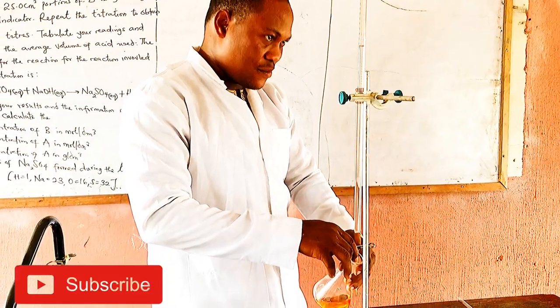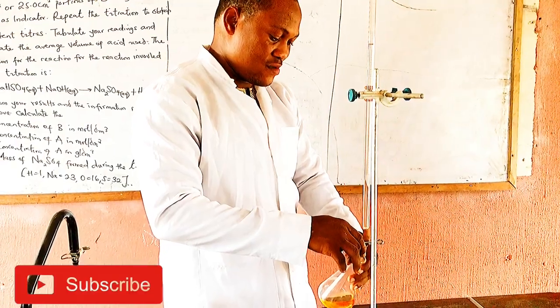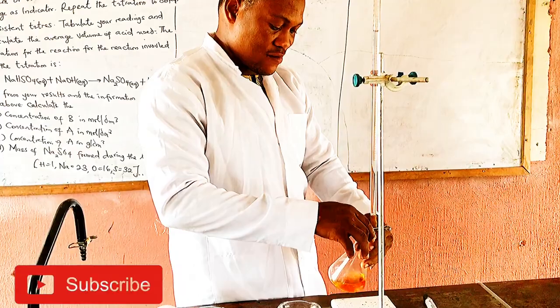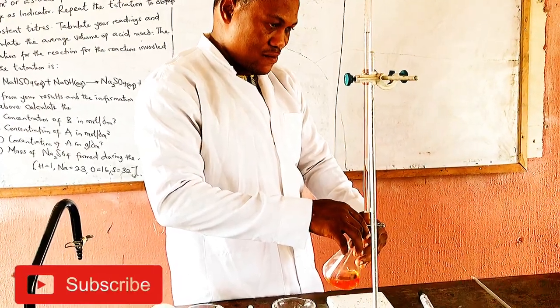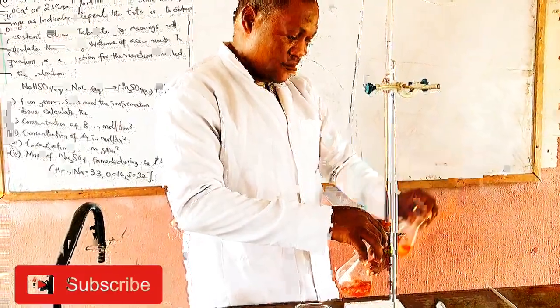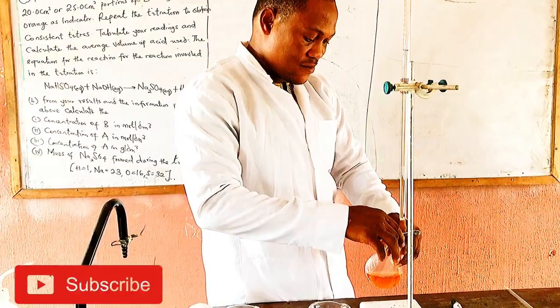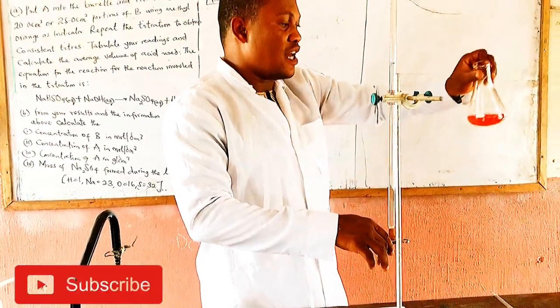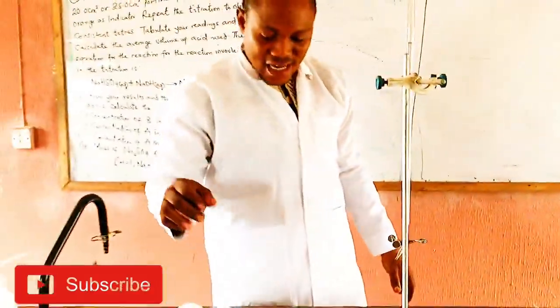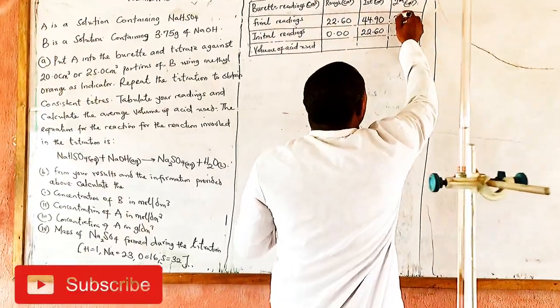Okay, please pay attention to this. Gently now, gently, gently. Okay. We're changing from the yellow color. Can you see that now? Changing from the yellow color. I take my readings again. That's still, oh, perfect. That's still 22.